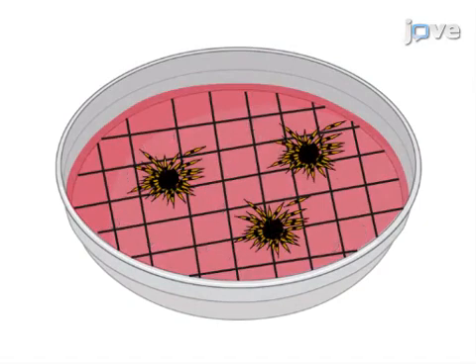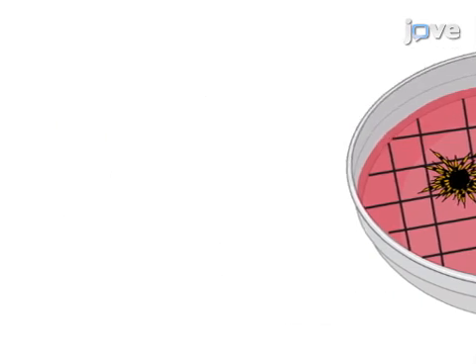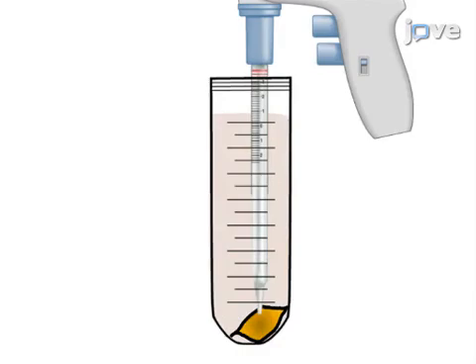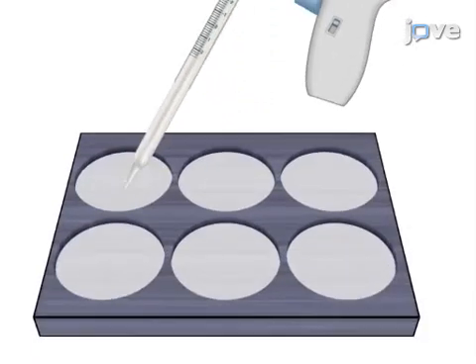The second step is to prepare collagen gels embedded with fibroblasts by mixing a collagen solution using the trypsinized cells and transferring to a six-well plate to gelatinize.